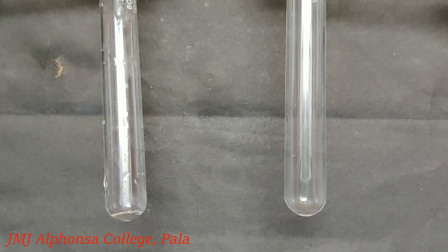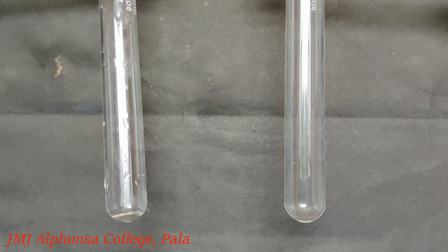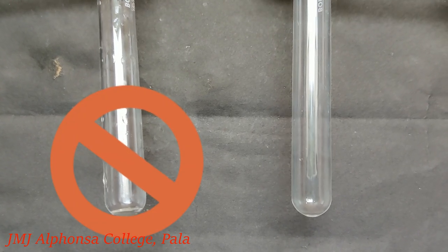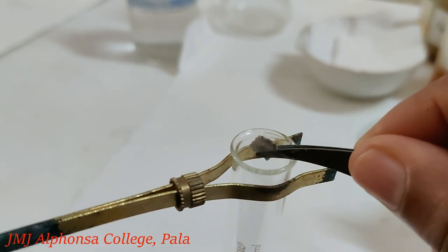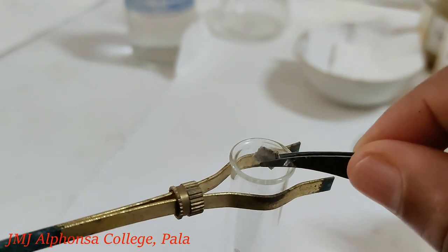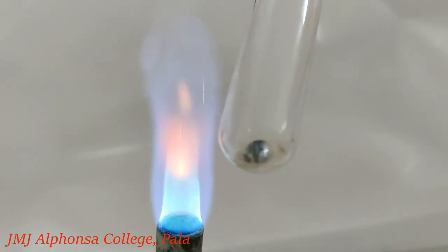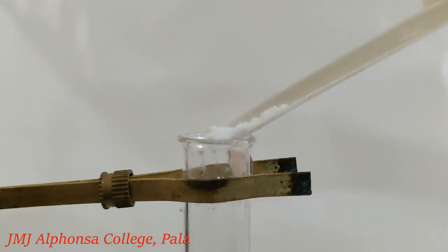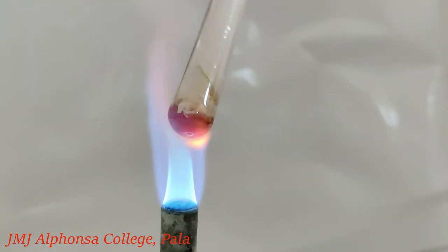The sodium fusion extract can also be prepared in a more easy way using a test tube. For this, take a clean and dry test tube. Take a piece of sodium, free it from kerosene and put it in the dry test tube. Heat it gently. Sodium melts and forms a silver globule. Add little of the organic compound into it. Heat gently first and then strongly till the tube becomes red hot.